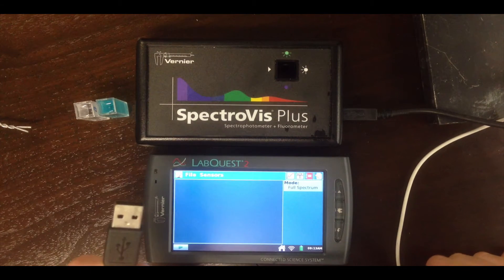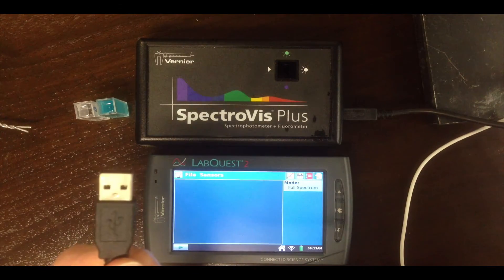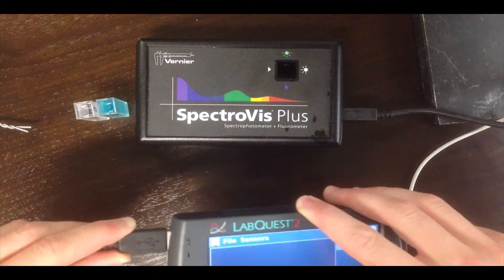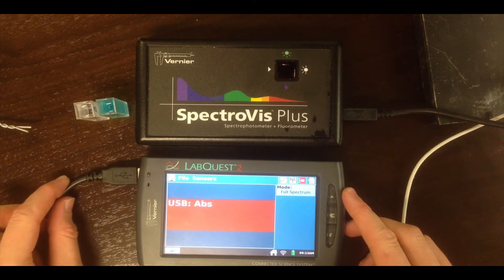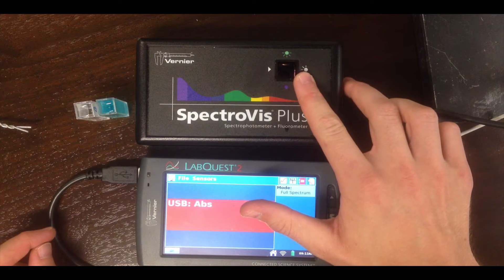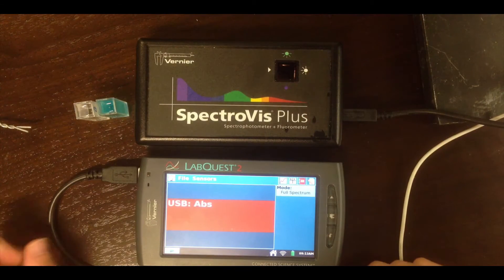The SpectroViz has a USB plug, which is different from a lot of the other LabQuest probes, so make sure you plug it into the USB port in the LabQuest rather than one of the digital probe ports. Once you plug that in, you'll see ABS appear on the screen of the LabQuest, and you'll notice a light come on inside the SpectroViz. This is the light source that's used to measure absorbance.